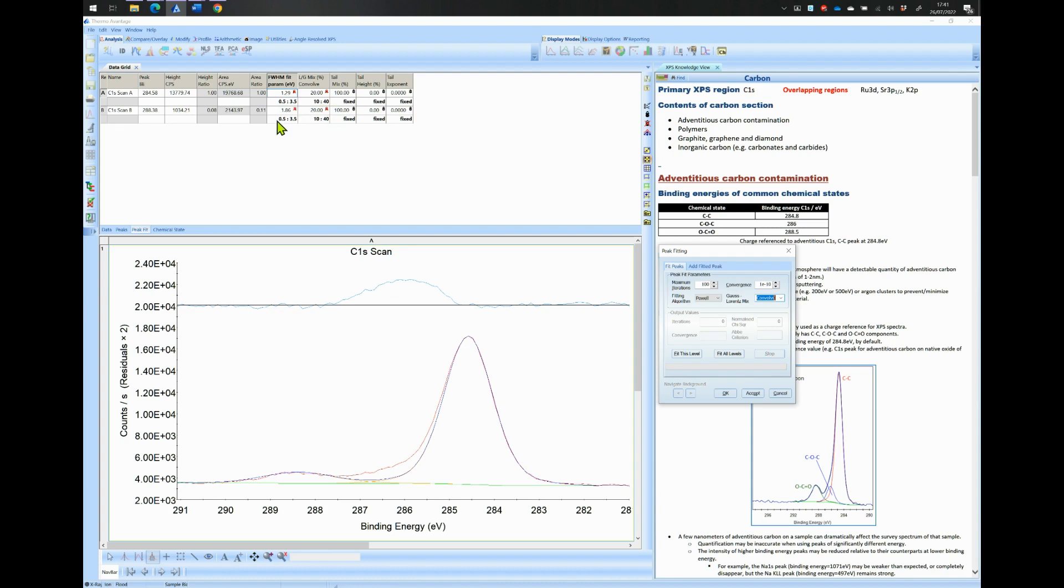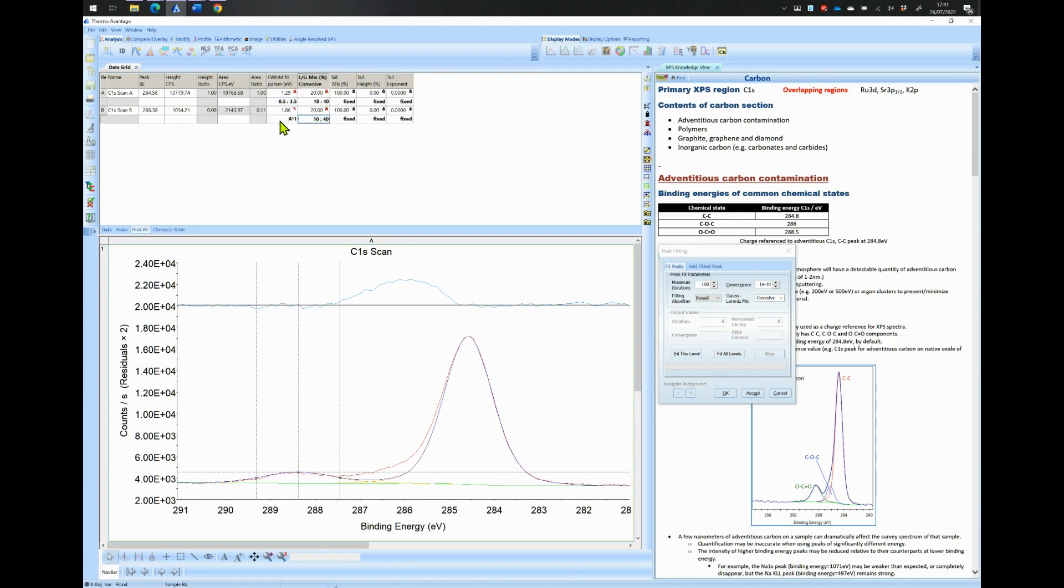To do this click on the constraint cells and constrain the width and the LG ratio of peak B to the ones of peak A. This is done by writing A times 1 in the cells shown. Then fit your peaks by clicking on the Fit This Level button.